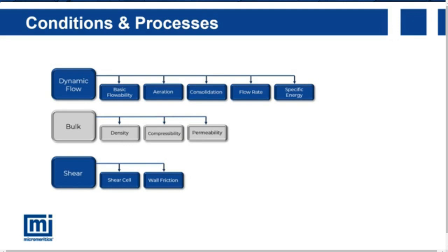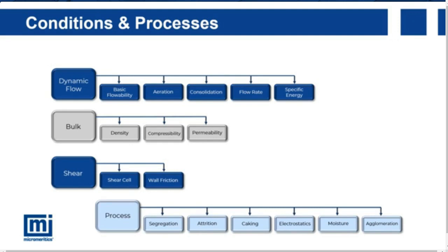Lastly, shear cell testing allows for the investigation of the transition between static and dynamic behavior at the highest of stress conditions. This completes the set of testing conditions, allowing access to the entire spectrum of powder flow conditions. By utilizing the appropriate tests relevant to a particular set of conditions, all powder flow phenomena can be probed.